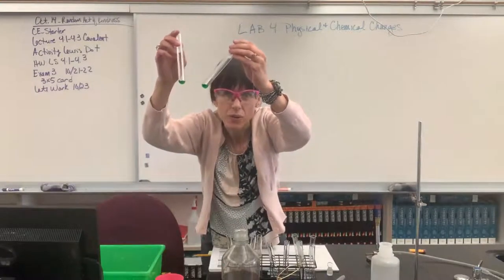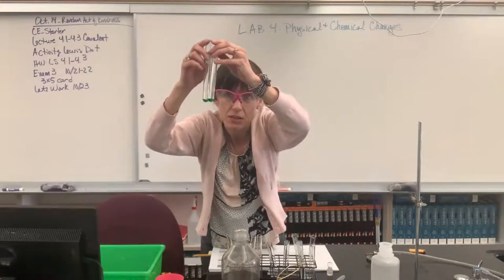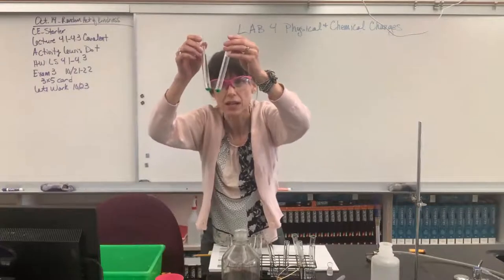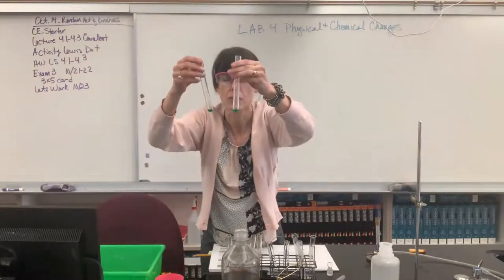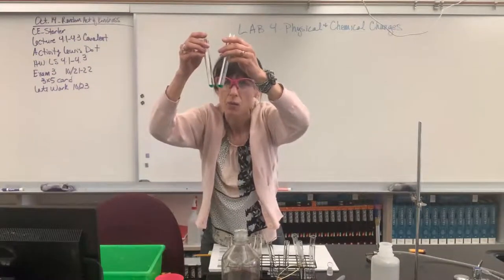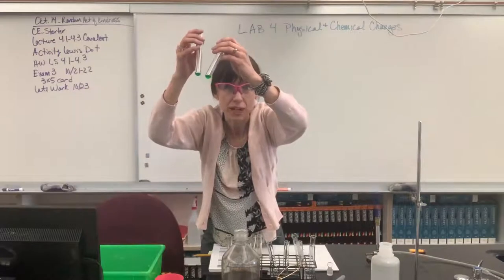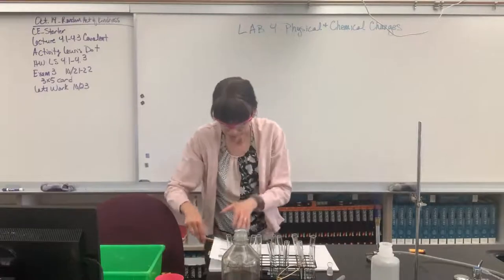So heating it up, that was just a physical change. It's identical green. It looks exactly the same. Turned black, which was probably an oxidation. And then we put the HCl, it reacted, and it just probably took on, it burned, is what it is. But then when you put the HCl, it brought it back to its original chemical composition. Wow. Wouldn't have guessed that. It's green, green, green. Let's record that.